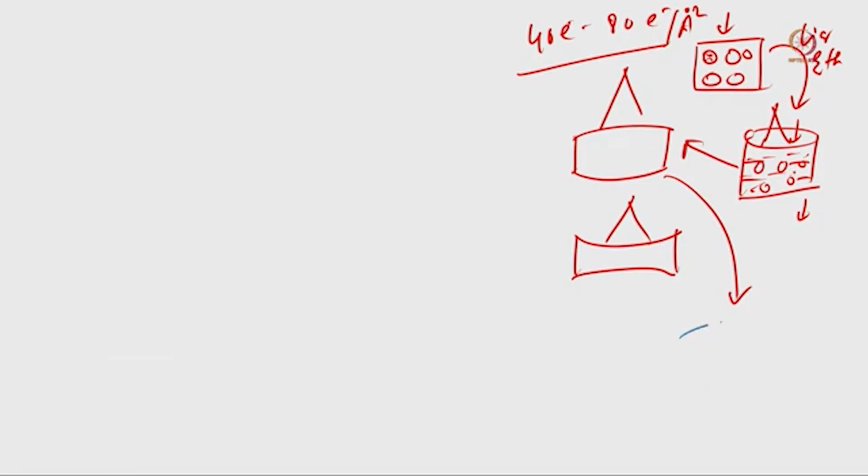There will be some kind of bulge in one particular area when the electron beam is there. So this may be bulged like that. There will not be a uniform shape of this ice anymore. So there will be some kind of changes in the ice. When there is a change in the ice, that is also changing the position of our sample, and the angle of this sample.